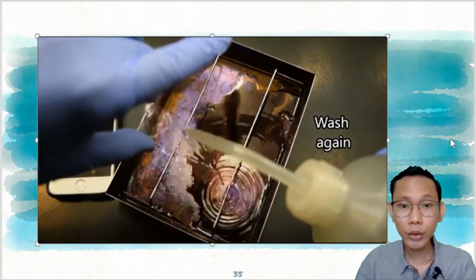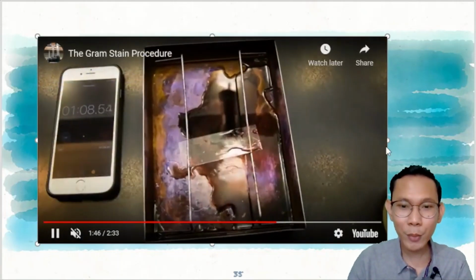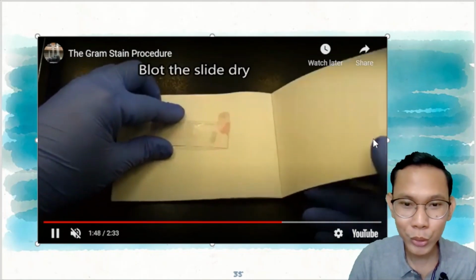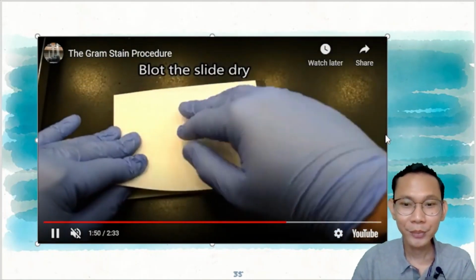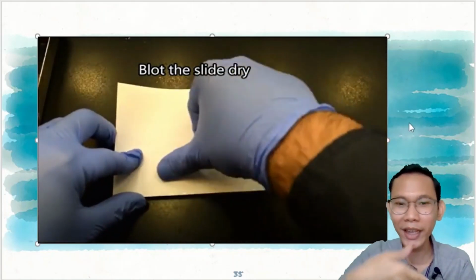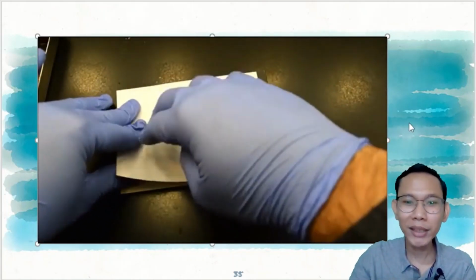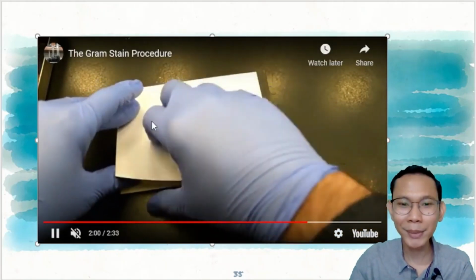Then, you wash it again and then let it dry. So, tingnan lang natin sa microscope kung anong pinapakita ba nila. So, you blot dry. Actually, ang ginagawa lang namin, pinapa-air dry lang namin. So, pinapaslant lang namin yung slide para air dry lang. Kasi napakatakot pag naka-blunt dry ka, patanggal yung specimen.